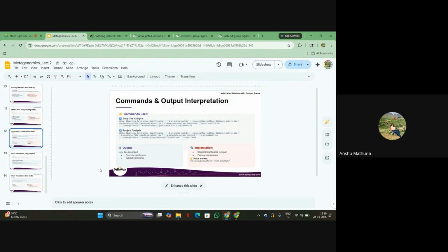for that you need to have a beta diversity analysis. And if you just want to check which microorganisms are present in one individual, for that you just do alpha analysis if you don't need any comparison. But if your aim involves a comparison between two different species, two samples or two individuals, then you generally go for beta diversity analysis.